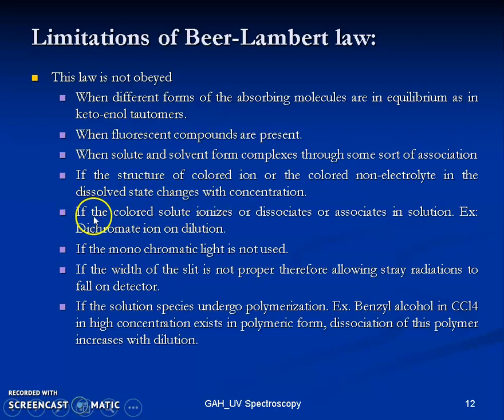The next point is, if the colored solute ionizes, dissociates or associates in the solution, for example the dichromate ion, whose color changes on dilution. So it is somewhat similar to the previous statement, where if the structure or the color is changing, then Beer-Lambert's law will not be applicable.